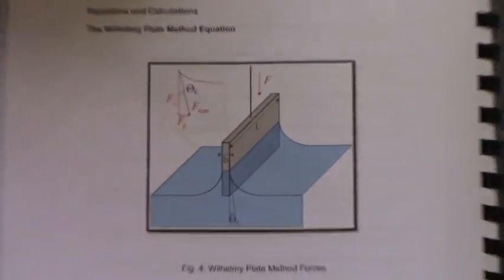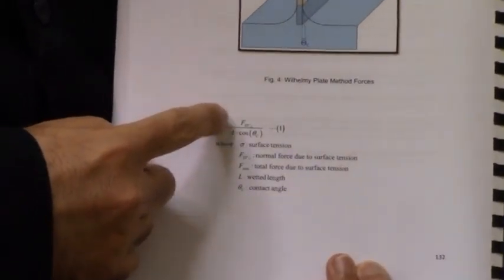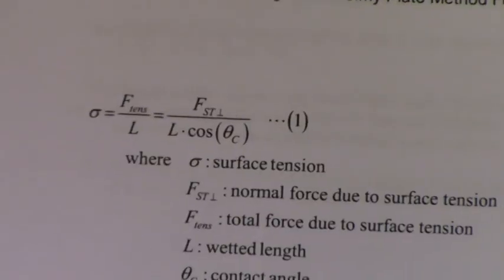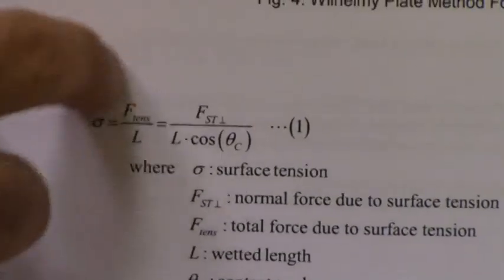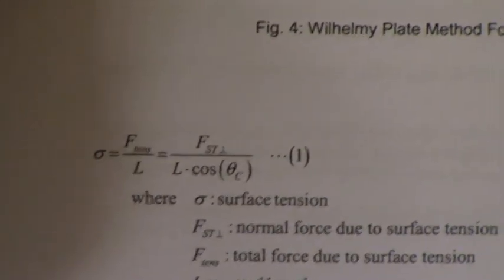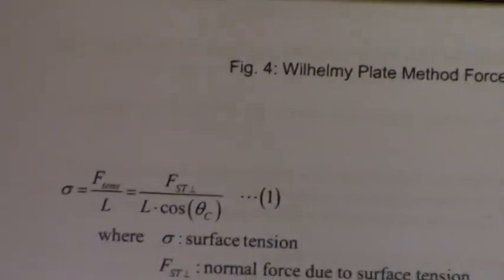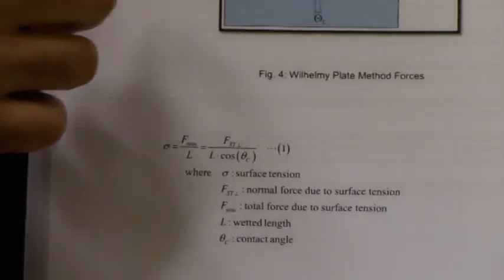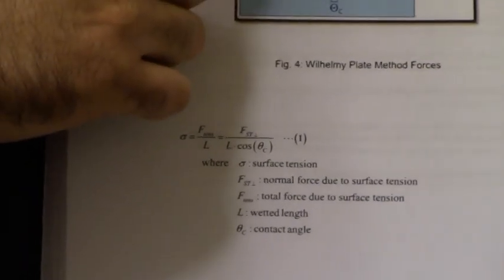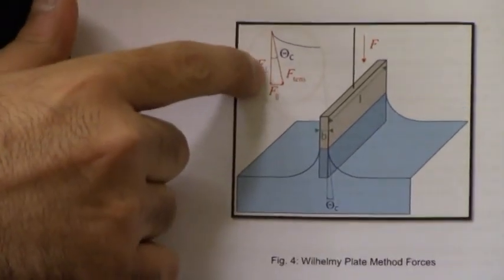And we have this equation, as we have seen in the demo video, that the surface tension is a force per unit length. To be able to do this, I need to know that this force is in the tangent, this vector F tens, which can assume in general some acute angle between it and the normal direction, F normal.